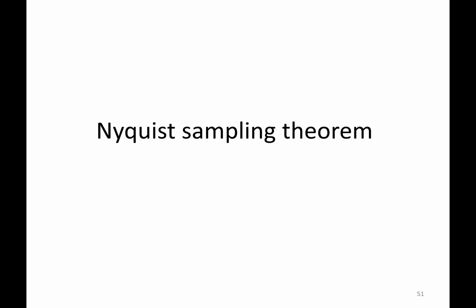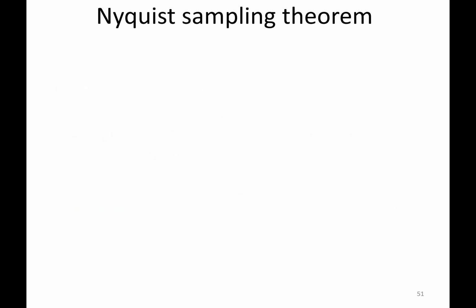Okay, I talked about the Nyquist sampling. This is where I want to pick up from here, the Nyquist sampling. And you see the Nyquist sampling, it tells us that if you want to sample spectra, if you really want to get a good spectra, then you need to do this. You need to obey this rule.